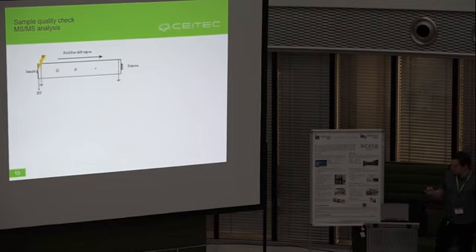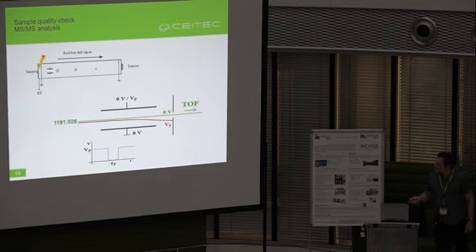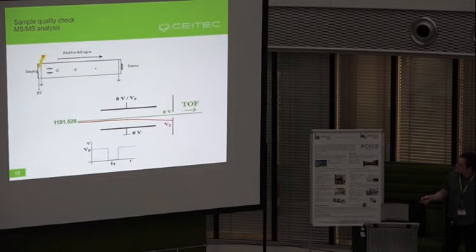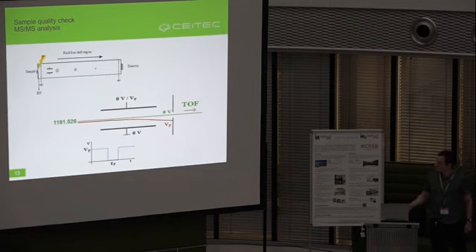However, if we fragment all the peptides from the entire peptide map, it would be impossible to interpret the MS-MS data. For that reason, we must add here some small slides with added voltage. It is called an ion gate, and here you have it in detail. As high voltage is applied on one of the slides, all ions that are passing through are deflected and their life is finished here. However, exactly at the time when our ion of interest is passing, we switch off the voltage and only this peptide and its fragments can be detected.